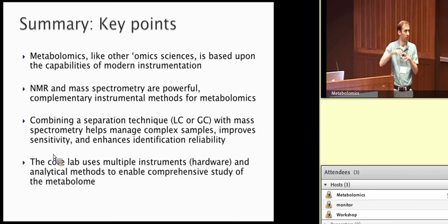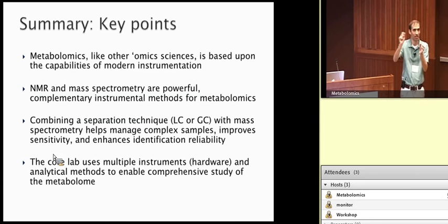We look at those, or the computer, depending on whether we're doing targeted or untargeted. We look at those fragments and say, does this look like something that is the intact molecular weight of a known metabolite? Or is it more likely that it's coming right along with another peak that is that intact molecular weight, but it's smaller or bigger, meaning an adduct, smaller meaning a fragment, bigger meaning an adduct, and I can tell you more about what that means. And if so, then let's lump that in with the main metabolite so it doesn't get reported as another feature.